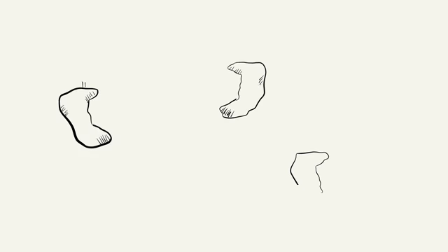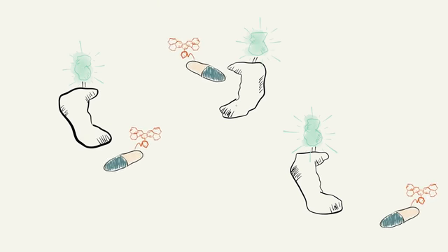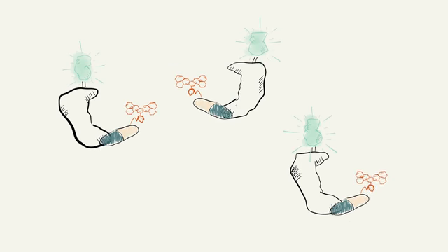First, we would tag Nanoluc to the protein of interest and express this inside cells. Next, we would introduce NanoBRET tracers that would go inside cells and bind to a site on the target protein. This would produce a NanoBRET signal.